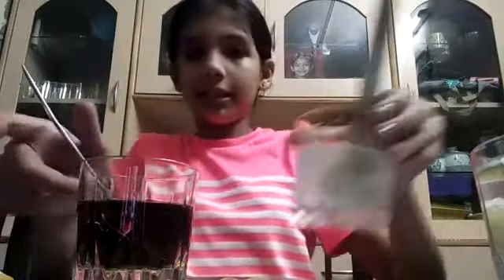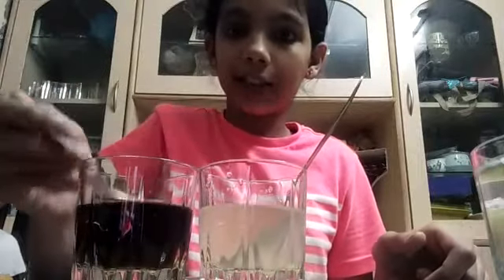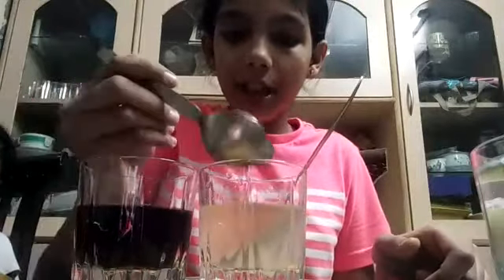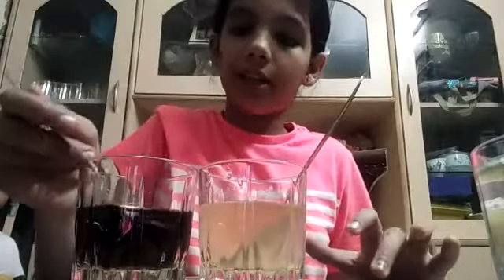And now I will put this in my lemon juice solution which is an acid. And it's becoming pink in color, as you can see. As much as I will add, it will become in magenta, pink, and red shades.